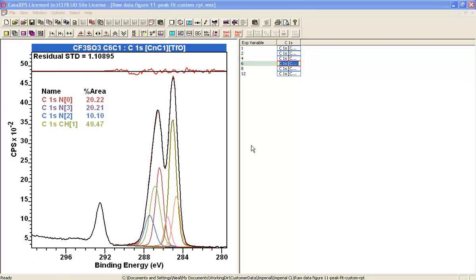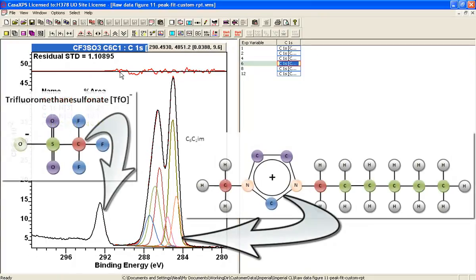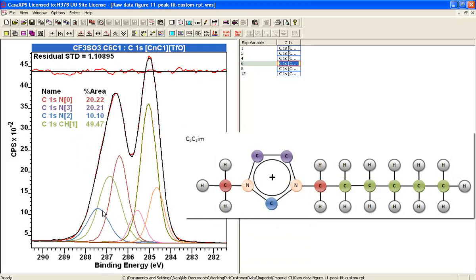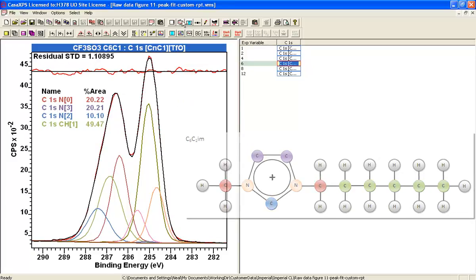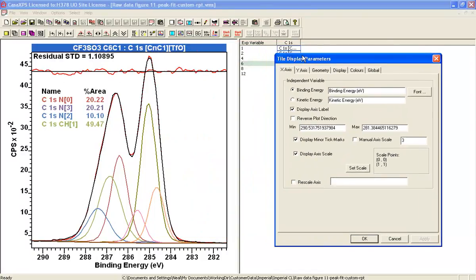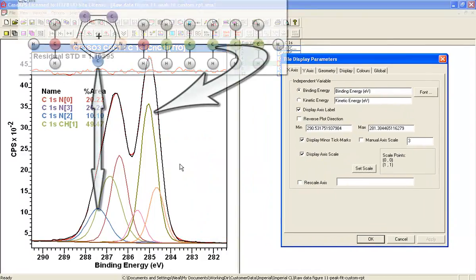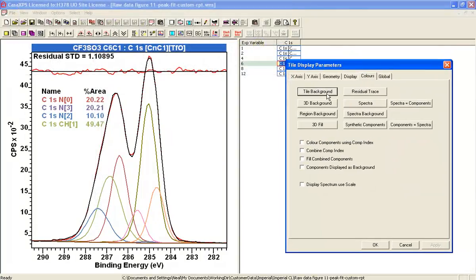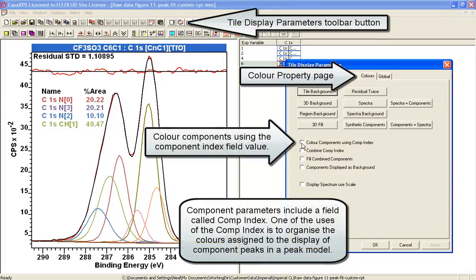This is an example of a peak model where a carbon-onless peak has been partitioned into signal associated with carbon bonded to nitrogen and carbon bonded to hydrogen. We will now show how to display the peak model so that these groupings are much clearer. The first thing I'm going to do is select on the color property page the color components using component index.